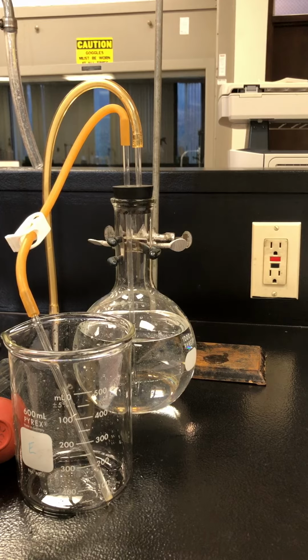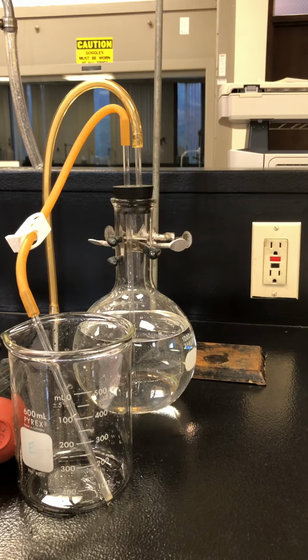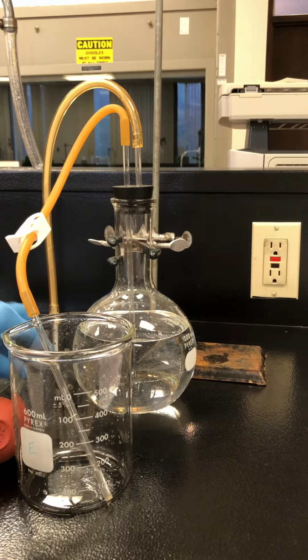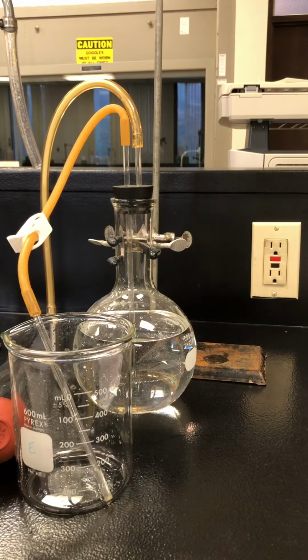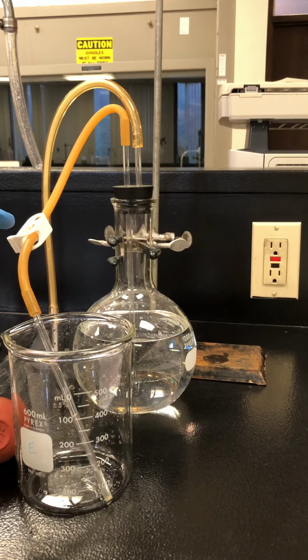So now when you go to set up your experiment, you will be attaching that open end to the stopper that contains your potassium chlorate, and then you will be releasing this pinch clamp before you ever start heating the system. So you are not allowed to start heating the system until I come and approve your system and approve that this clamp has been completely released before you start heating.